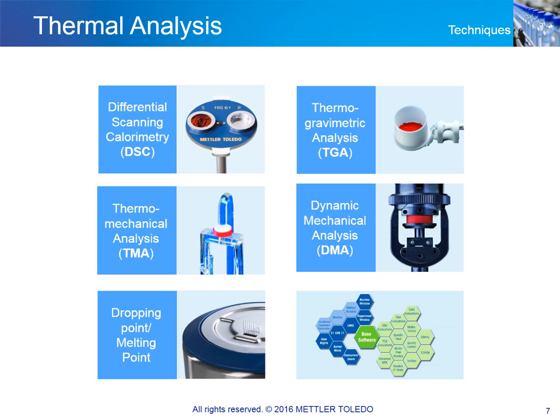Melting point and dropping point instruments. The picture shows a melting point instrument with sample capillaries inserted into the instrument. It can simultaneously measure 6 samples.